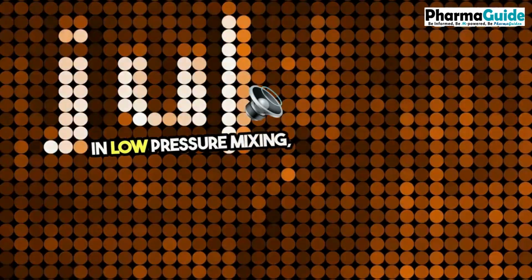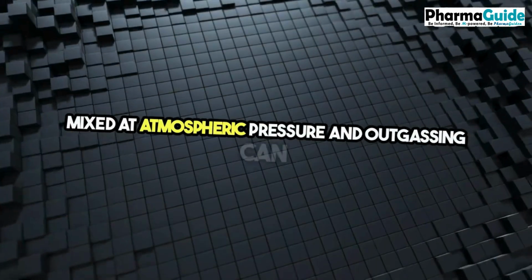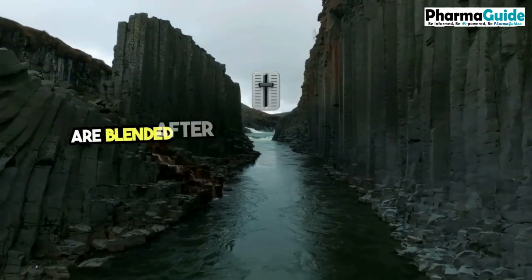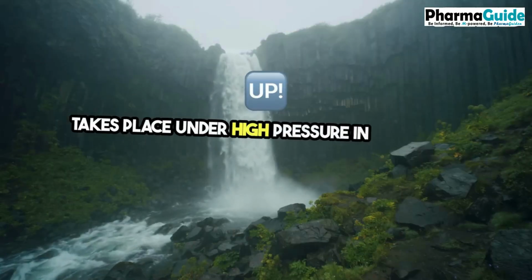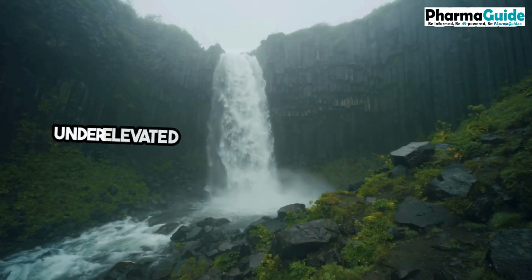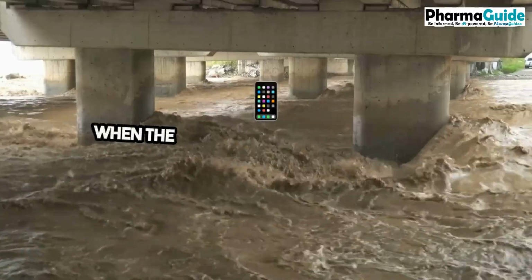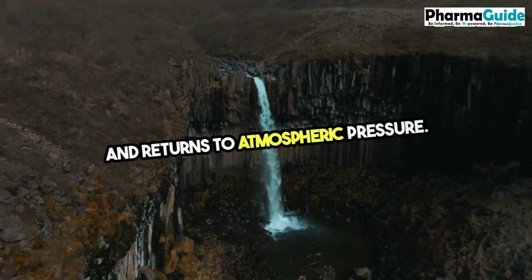In low pressure mixing, the solvents are mixed at atmospheric pressure, and outgassing can take place anywhere down the flow path. On the other hand, in high-pressure mixing, solvents are blended after passing through the pumps, and mixing takes place under high pressure in the mixing chamber. The mixture may be saturated, but under elevated pressure outgassing is prevented. Bubble formation, if any, can take place when the mobile phase exits the column and returns to atmospheric pressure.